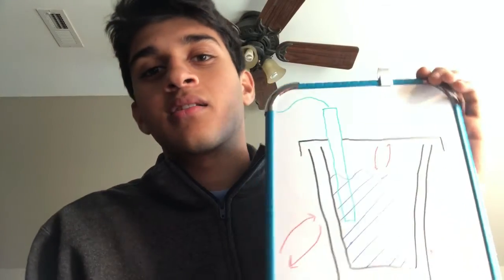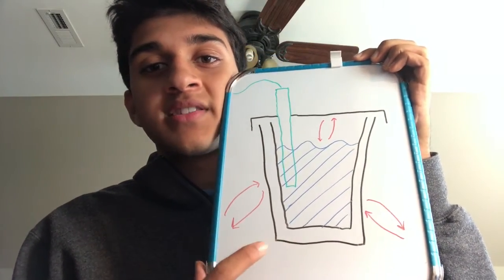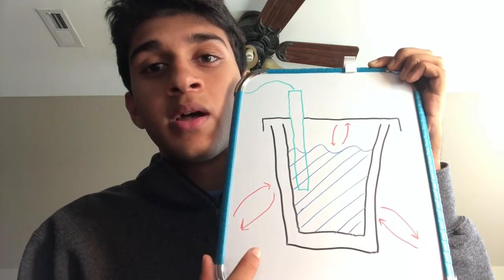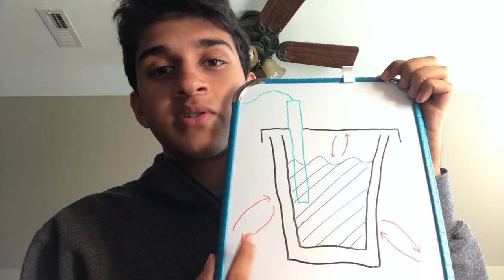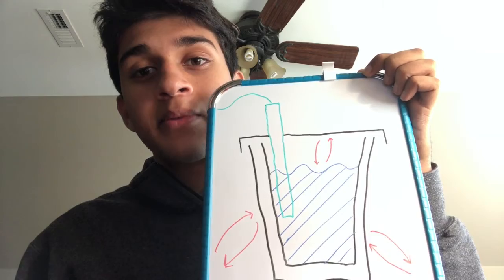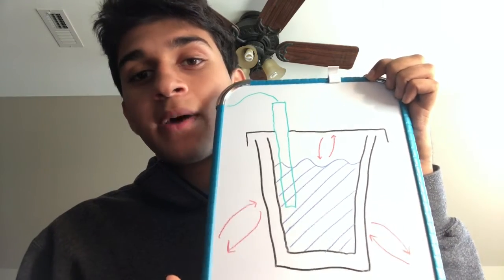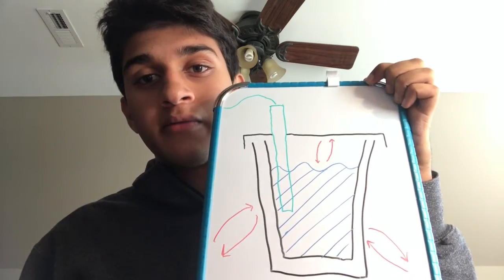In calorimetry, we make a calorimeter by having two coffee cups. The coffee cups are made out of styrofoam, as can be seen in this diagram. You can see the two coffee cups and the styrofoam. The styrofoam prevents heat from coming in, as seen by the red arrows. It bounces back, and also over here, it is preventing heat from escaping and pushes the heat back into the solution where it can be measured by the temperature probe seen above.